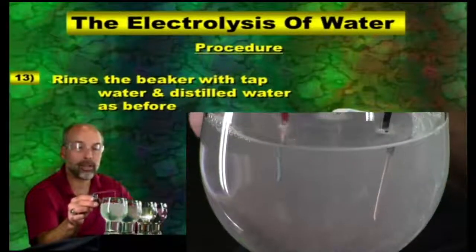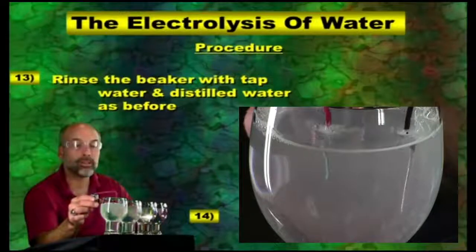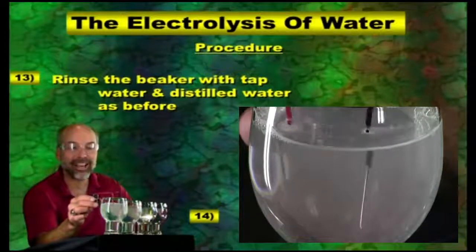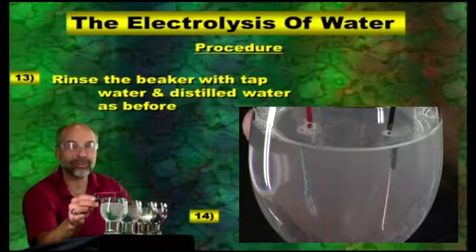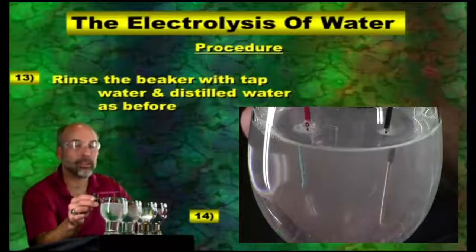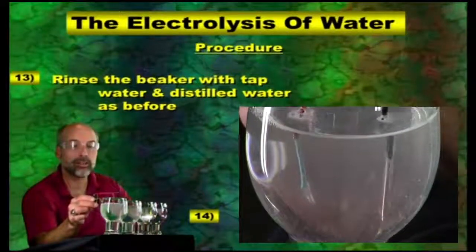And many times they talk about detergents having a two-sided molecule. One side is actually covalent, and the other side is ionic, believe it or not. The side that's ionic is the side where I'm seeing bubbles forming. Very, very interesting. So here's a molecule that actually has both sides to it. Pretty crazy. And the reason why that works is the ionic side is going to be the side that can dissolve in water real easy. You don't have any problems.